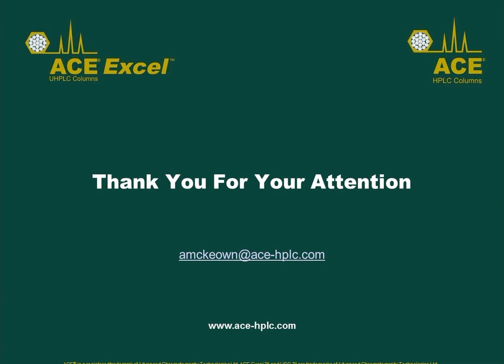So this is one of the classic questions I get asked all the time: how do I do method development? What I've tried to show today is a very simple three-column, three-bonded phase, two-solvent system method development activity. Now, you can use one column. The simplest form of method development is where you have one column, one temperature, one mobile phase A and B, and you essentially try and develop your method from there. So maybe you vary just the gradient, the shallowness or the steepness of the gradient, and try and pull your peaks out that way. That's the simplest way you can do it.